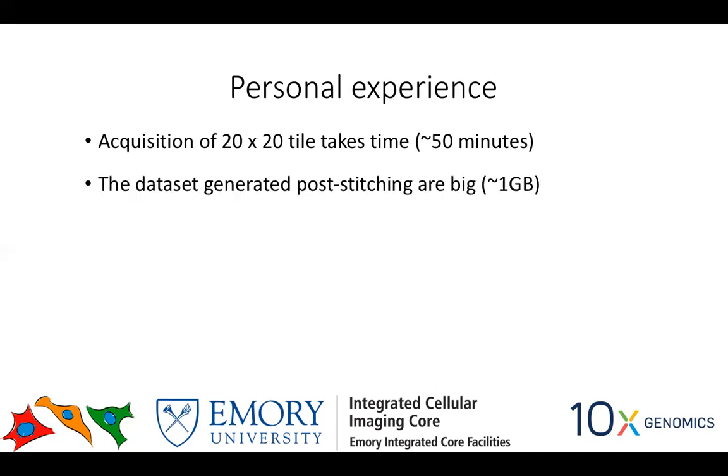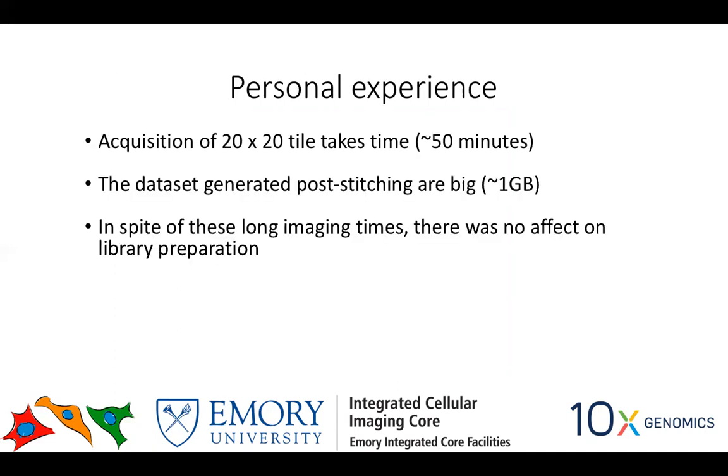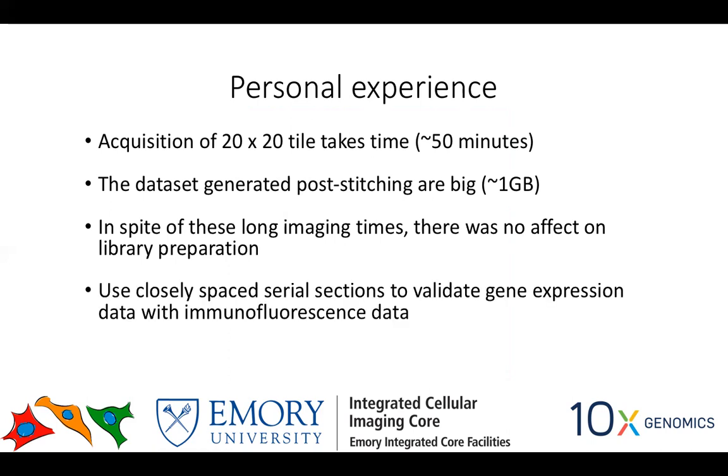The data set that gets generated post stitching is big. It's roughly about 1 gigabyte in size for each of the images that you are looking at. In spite of these long times, when I helped Vasanta, there was no effect on the library preparation or the quality of the RNA. That was also perfectly fine.